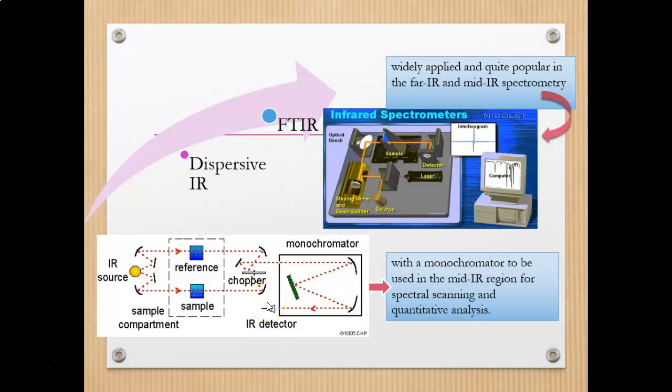Different functional groups will absorb characteristic frequencies of infrared radiation, so it will give a characteristic peak value. The IR spectrum of a chemical substance is a fingerprint of a molecule for its identification. The monochromator acts as a splitter.